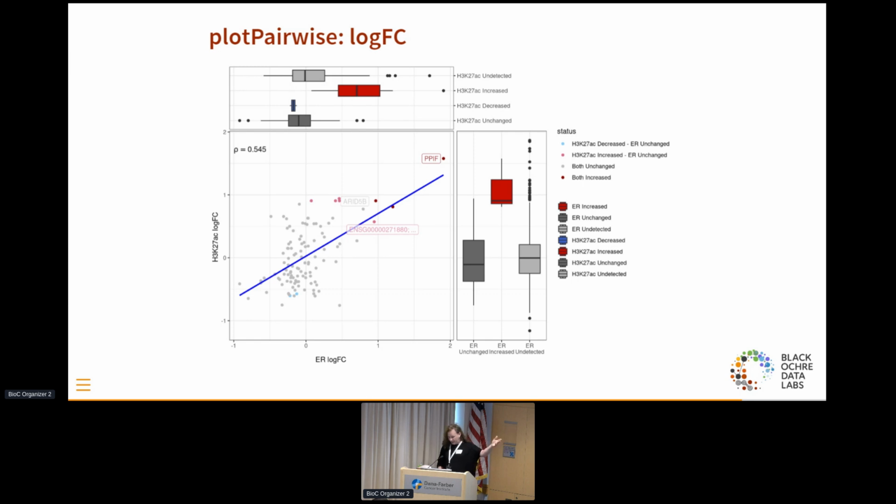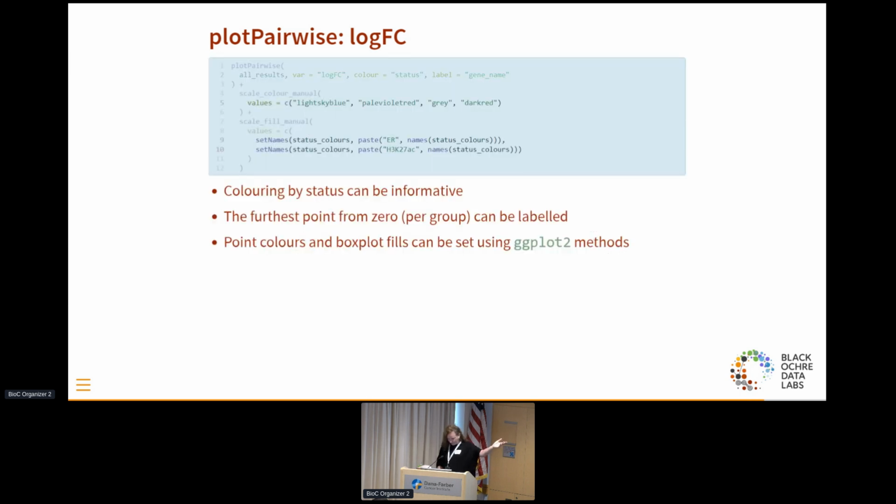And I haven't tweaked that plot. That's just the code. I've added some scales because they're just ggplot objects.